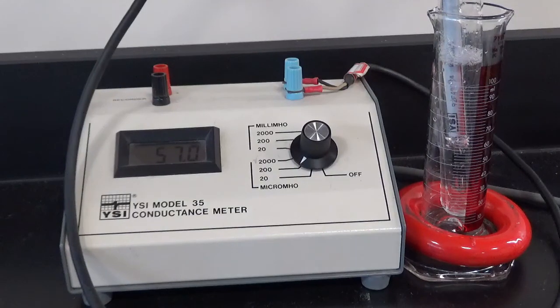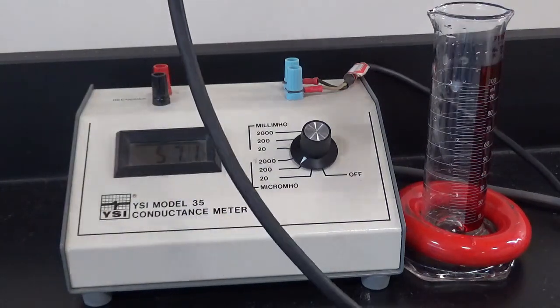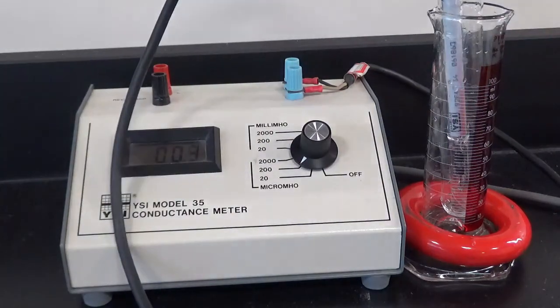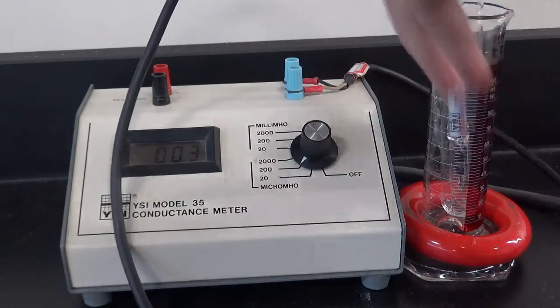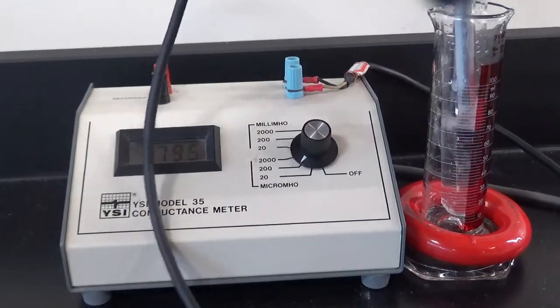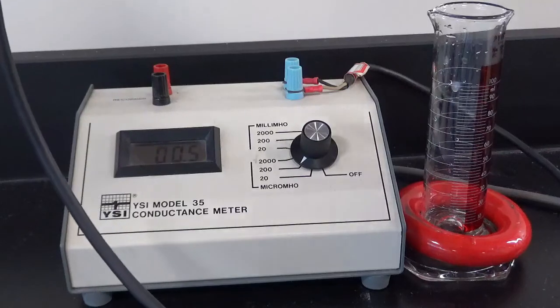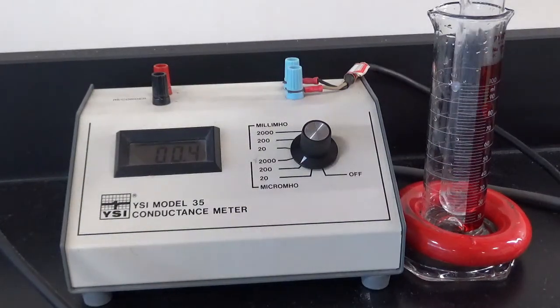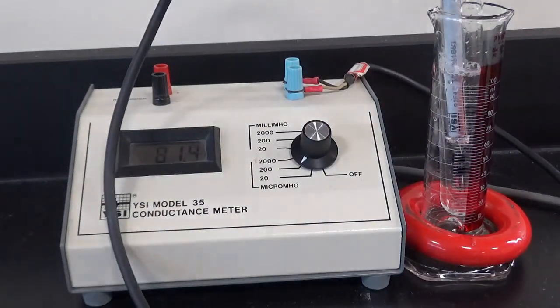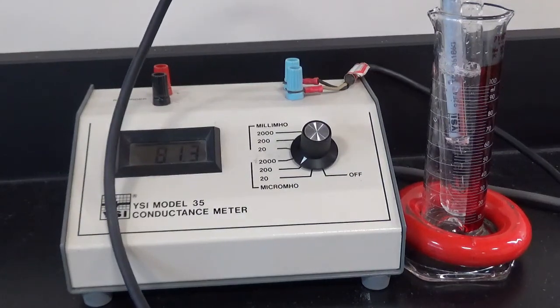Okay, and I see it says 57.0. Solution 5. Looks like it says 81.4.